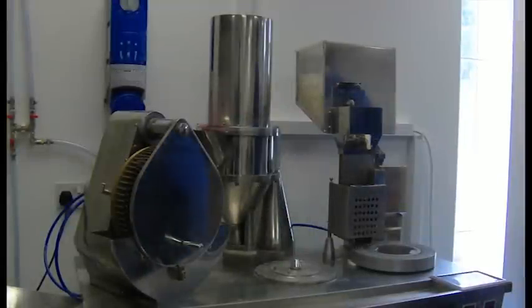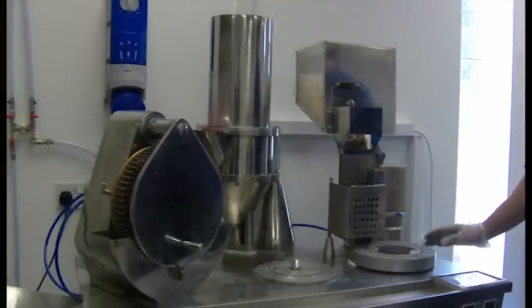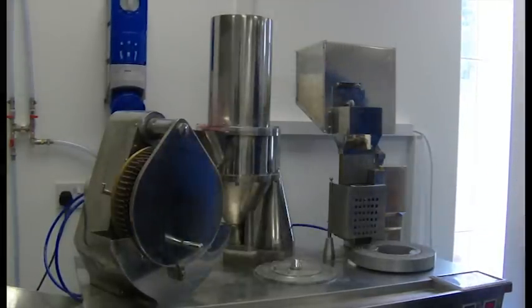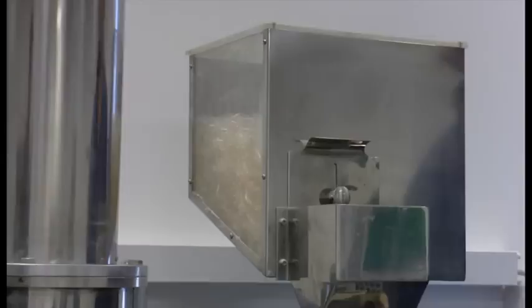Hello and welcome to the LFA introductory video for the DTJC semi-automatic capsule filling machine. This capsule filling machine can produce between 10 and 25,000 capsules per hour depending on capsule size and operator proficiency.